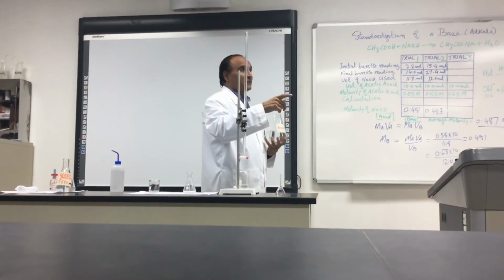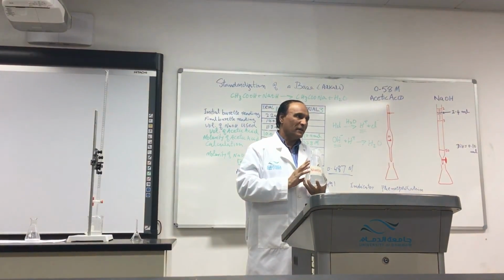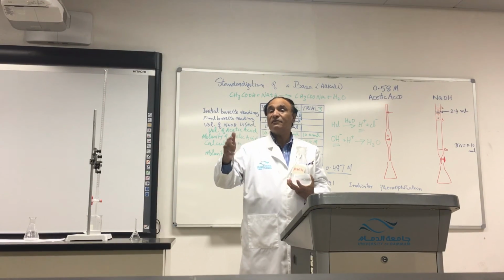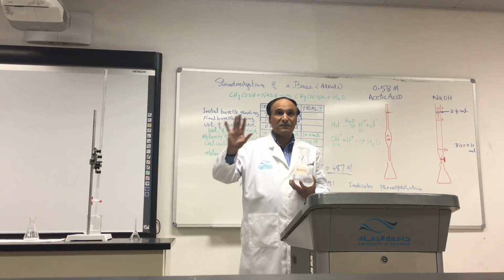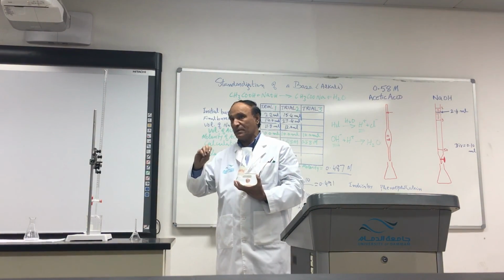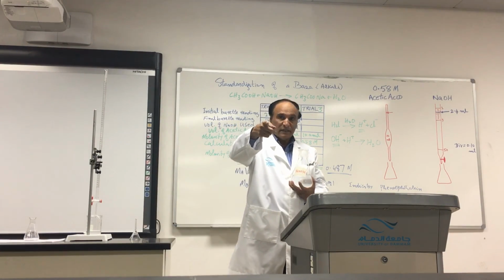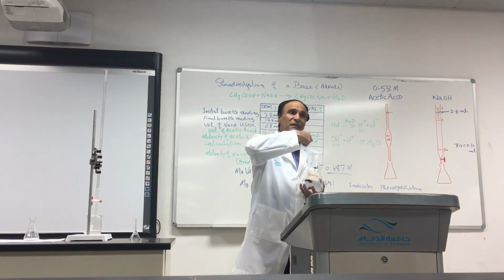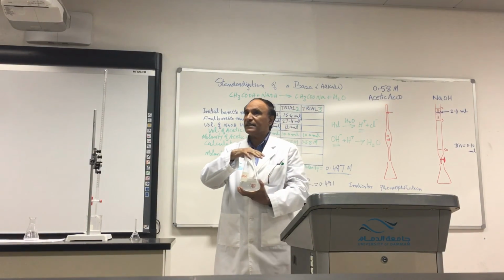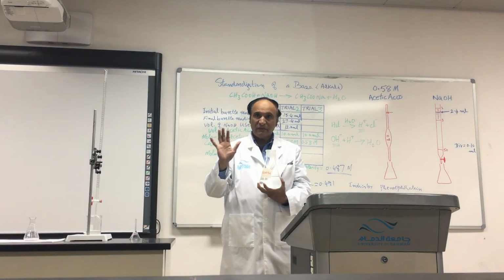Everywhere in the world, those who are studying chemistry, they do this experiment. And when you come next time, I hope inshallah there will be no problem. It's very easy. I have explained everything in a nice way. If you have any question, do ask me. And read it also in the book. There is standardization of the base, the same experiment is written in the book. So I hope you have understood how to do the experiment. Is that understood? Yes. Very well understood?